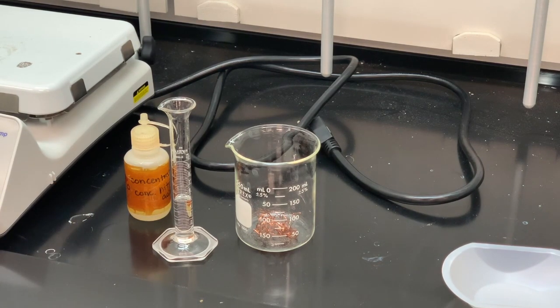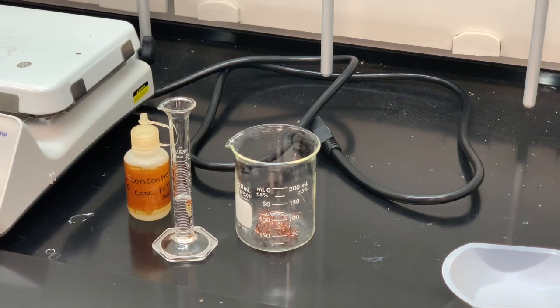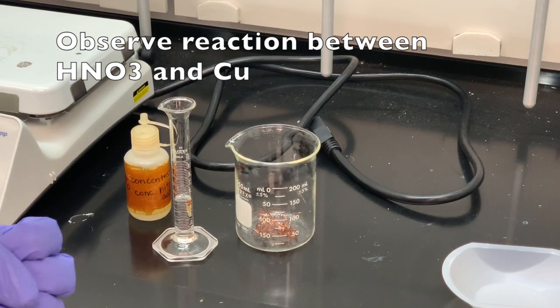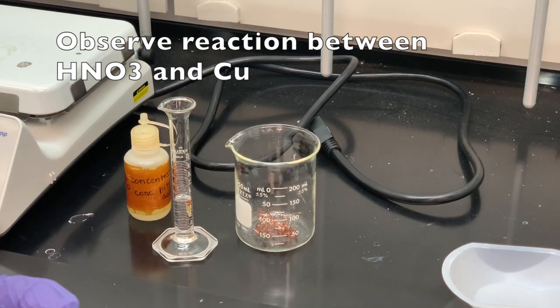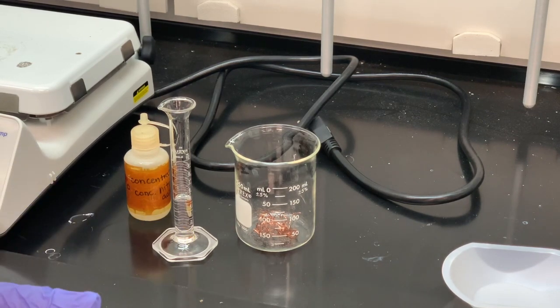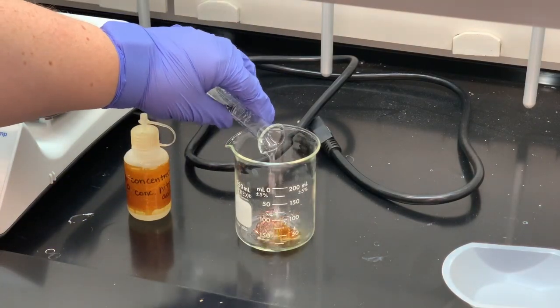So what we're doing in the procedure is we're going to add this nitric acid to the copper, and then you're going to observe what happens. The book is a little bit misleading where it tells you to record the observations after you've added water. You want to make sure that you record your observations for this particular reaction. After this reaction subsides, we're going to add water to that and just look at the solution. There is no reaction when we add that water. There is a reaction when we add this nitric acid. You also want to do this in a fume hood because there is going to be a gas released and you do not want to breathe that gas in.